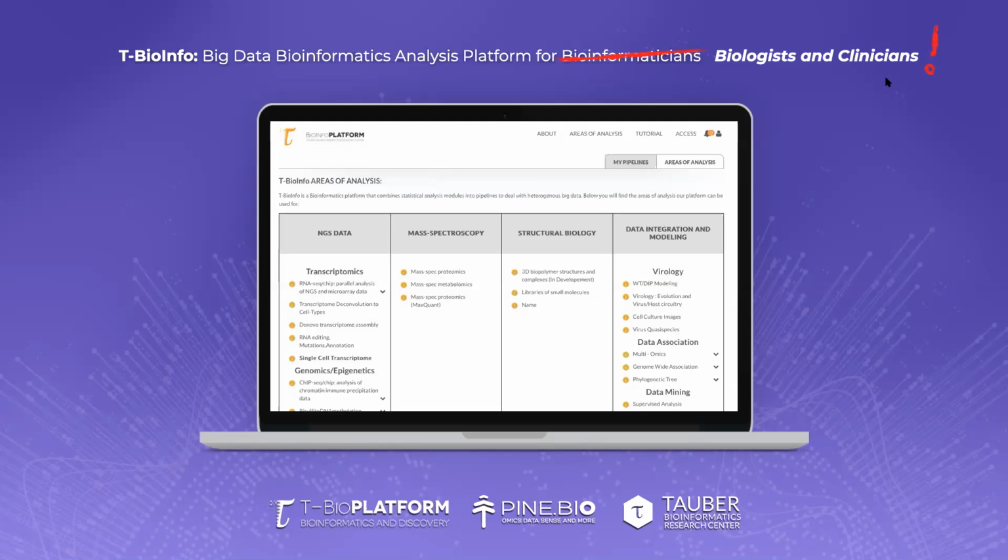So we are hoping that if you are coming from a life science background or in medical school or potentially even working as a clinician, you're probably already recognizing the fact that next generation sequencing and genomic data has transformed our understanding of many diseases and many types of conditions. So using these tools, you'll be able to actually process and analyze data without any coding.